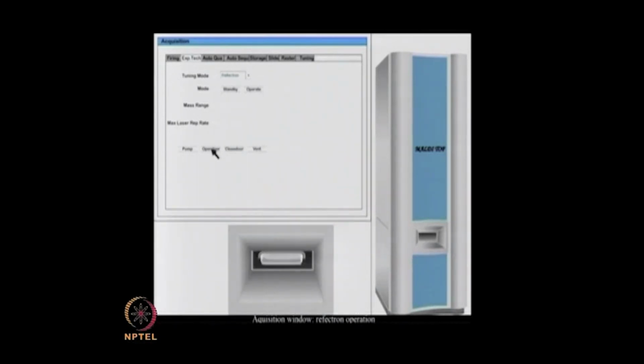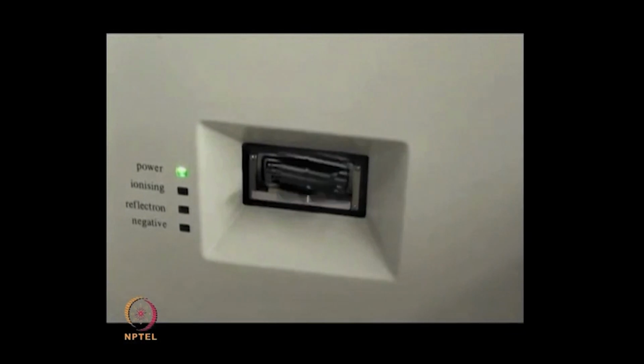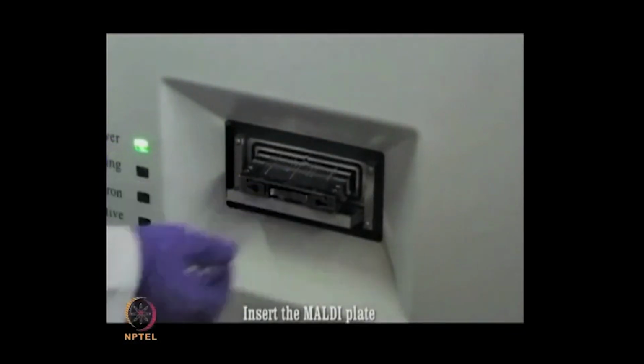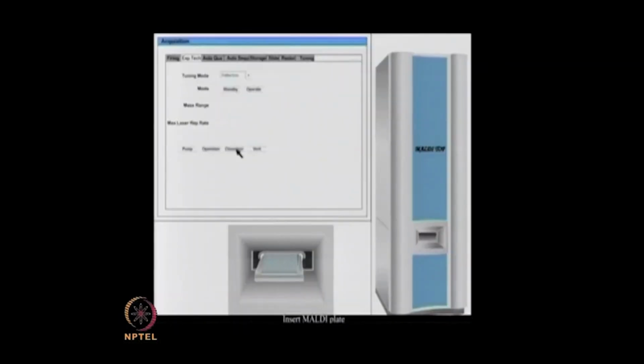So, click on the software and open the acquisition window, and then click on the open door. Insert the MALDI target plate, face up with the cutoff corner to the front, and now by using the software, close the door.